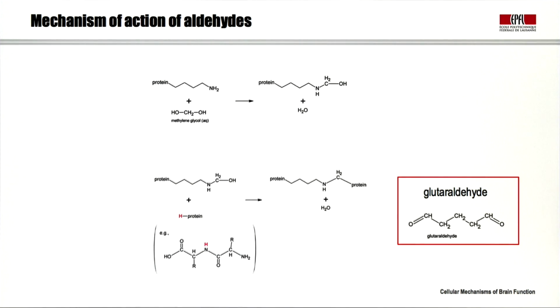In electron microscopy, we also use the glutaraldehyde fixative. And glutaraldehyde has these aldehyde groups, one at each end, linked with this chain of methylene bridges. And here we have the opportunity to form many more cross-links and therefore a much stronger fixation.